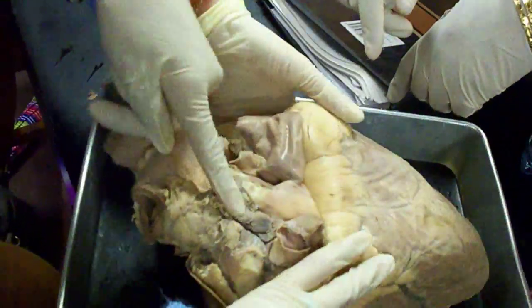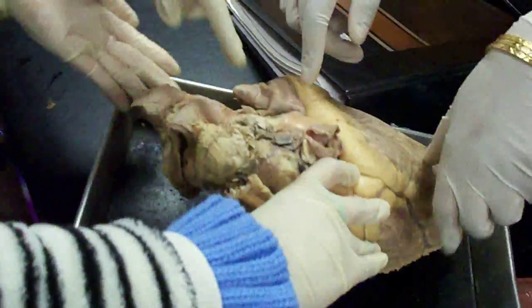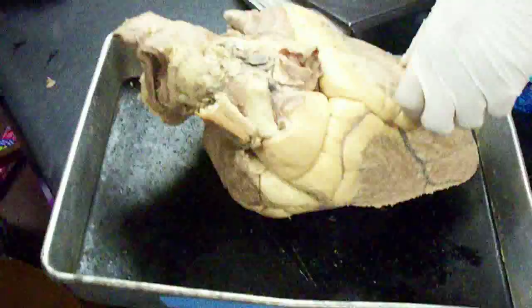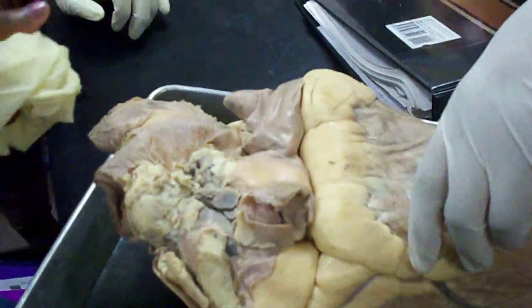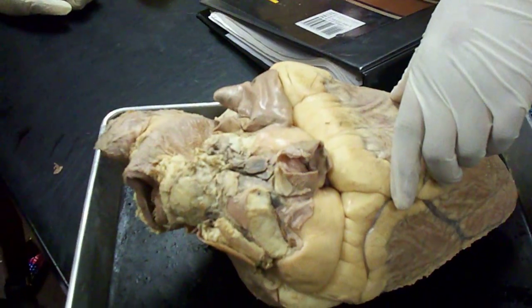You're actually gonna go into it. Let me see. You can actually go into it though. Okay, that's nasty. So this is superior vena cava, this is pulmonary trunk, and that's the aorta.